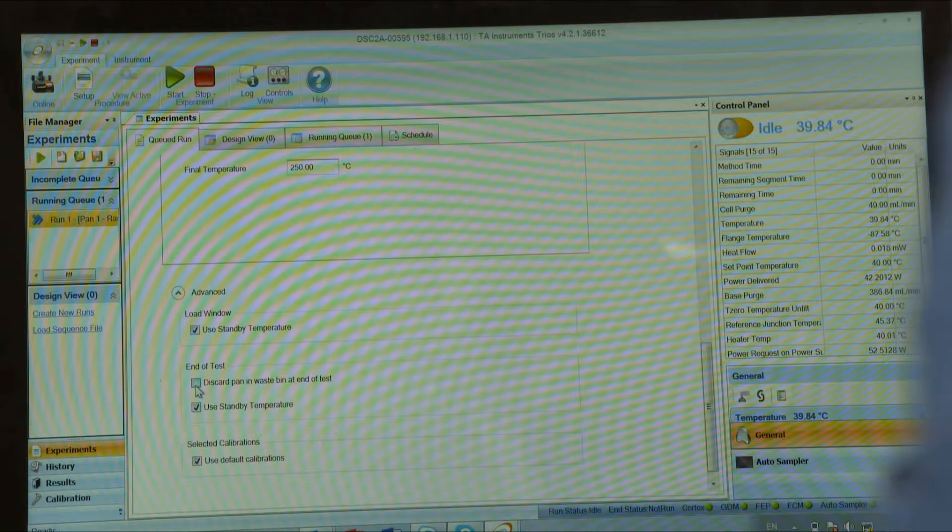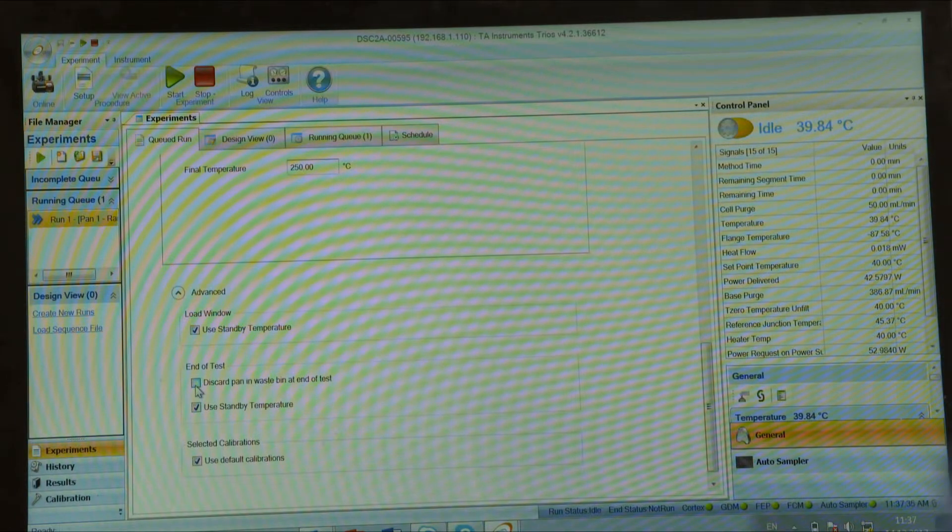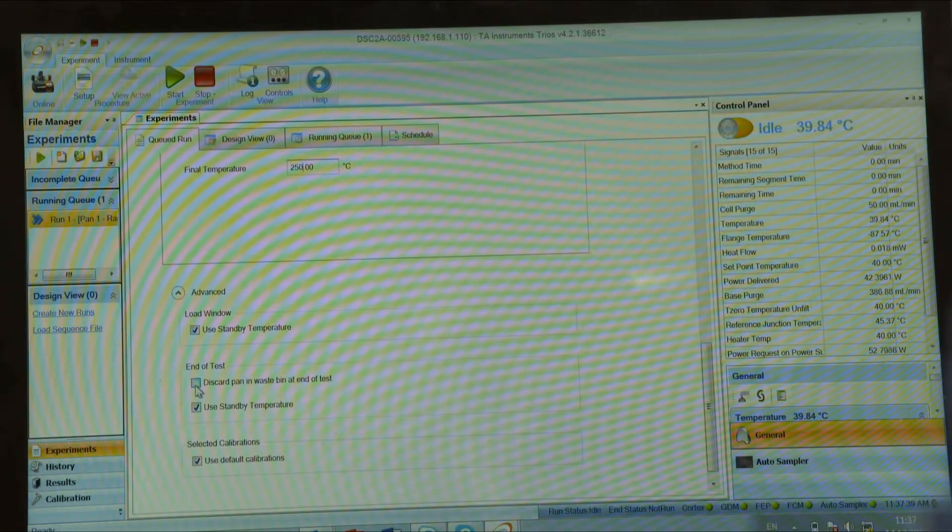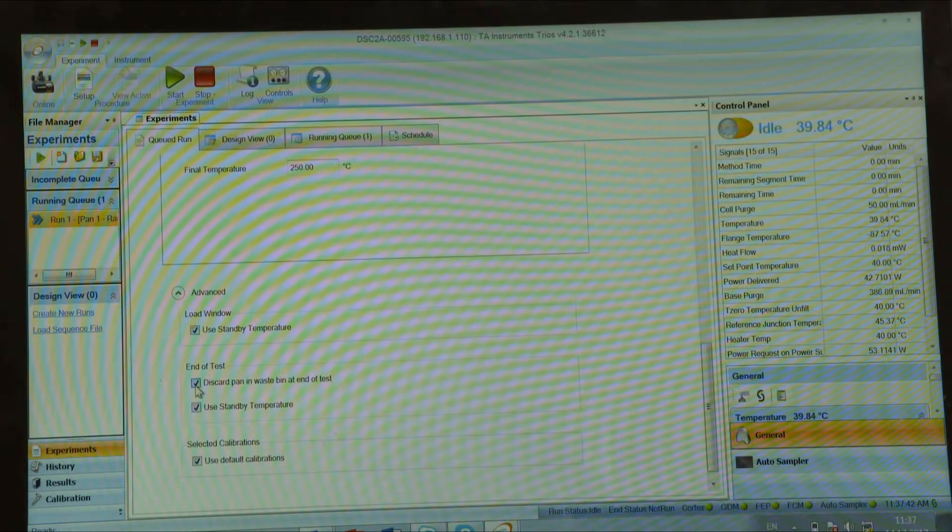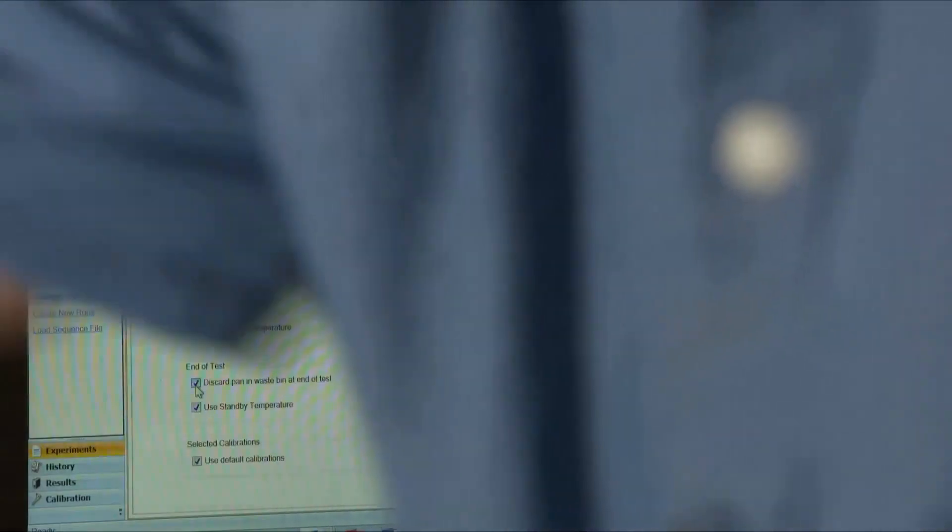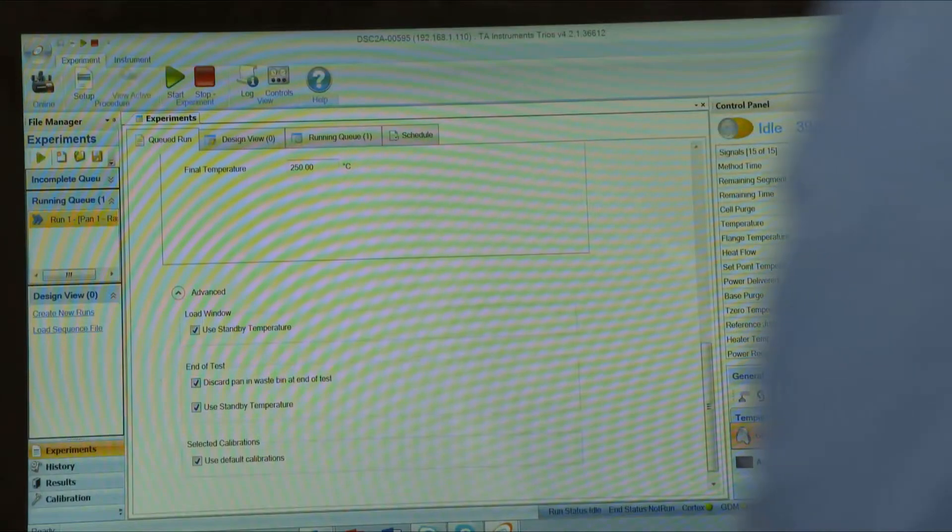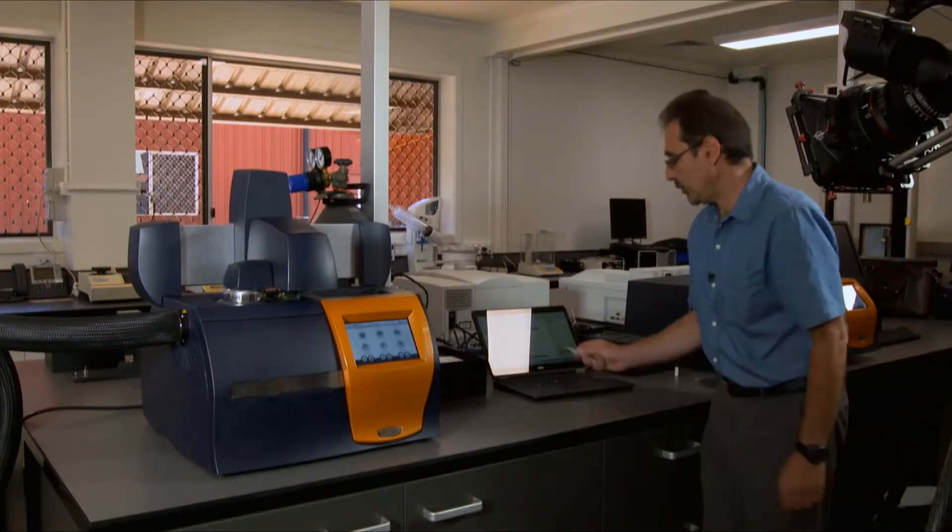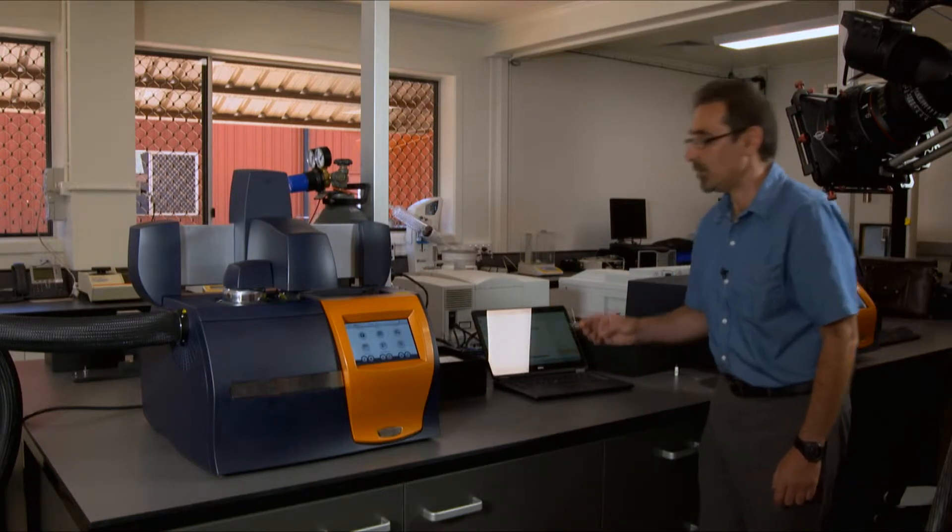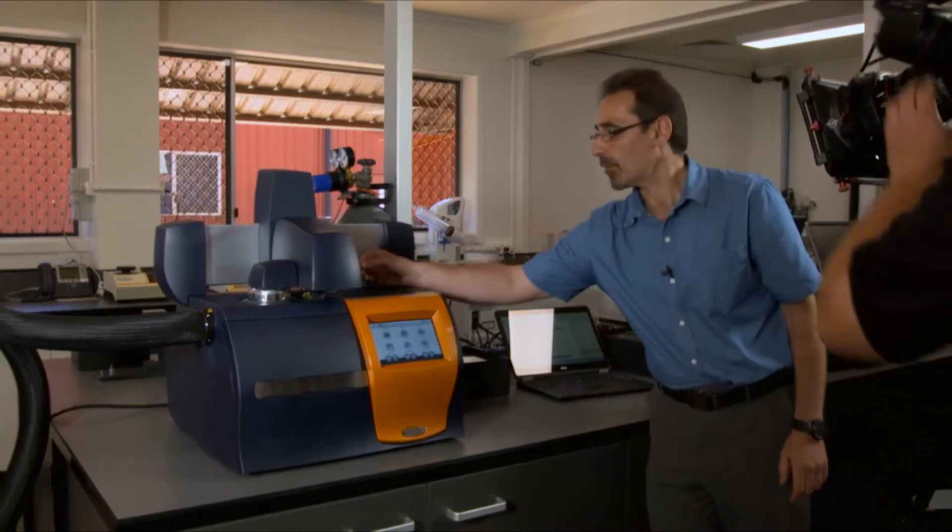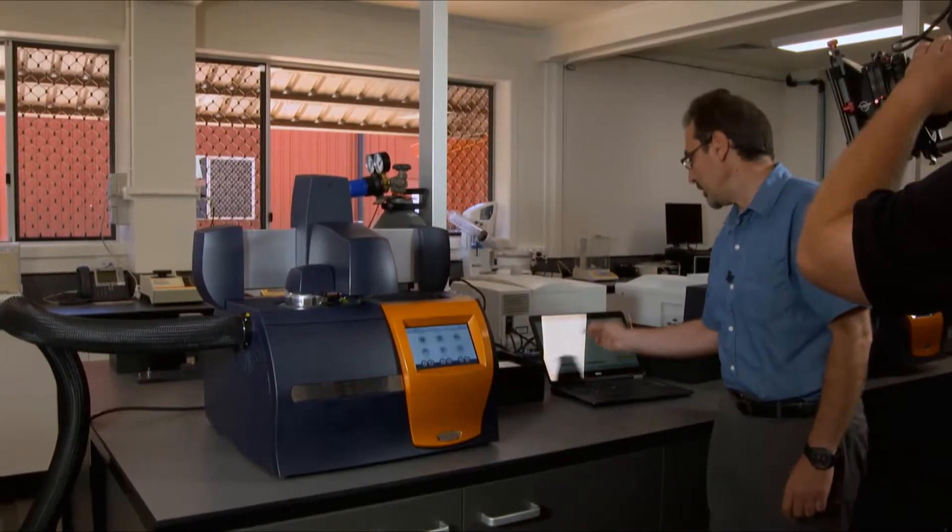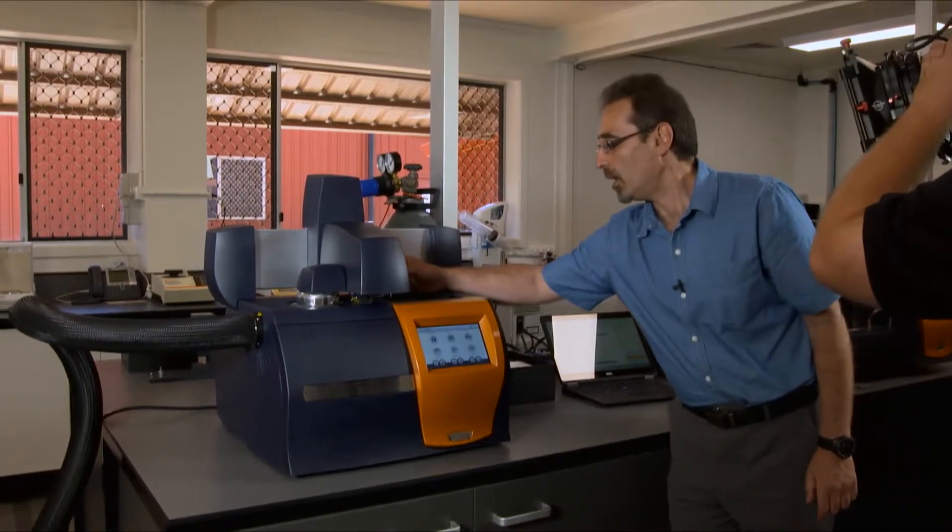You have an ability to discard pan after the ramp if you wish to do so. If you check this box here, it will put your pan into the waste bin on the instrument. Okay, my run is ready to go. I have to make sure that my sample is in position one and my reference is in position four.